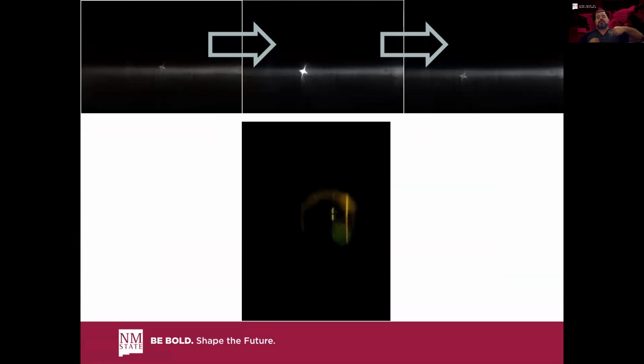You basically have acoustic forces that are canceling each other out, going against each other, and, like in this case, that's what I did here, you slowly allow the particle to transit through the excitation source. In a regular scenario, your acoustic focusing is applied across the channel, and you can have your sample traveling through the capillary in a linear fashion.